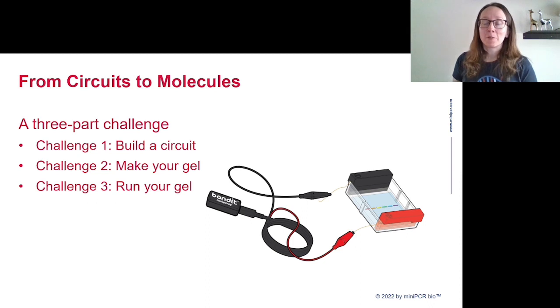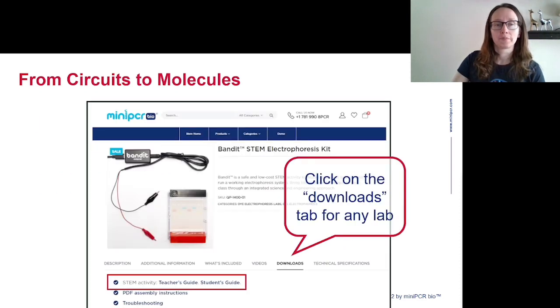That wraps up our From Circuits to Molecules Bandit Assembly Activity. It is a way to walk your students through the process of assembling and running Bandit that's pedagogical and requires them to think critically and actively about the science underlying this technique. You can download this activity for free if you go to the Bandit page in the MiniPCR store. If you go to the Downloads tab, you'll find the Teacher's Guide and Student's Guides for this activity. This is an activity that you can add on any time you use the Bandit system. You can also not use it at all. We have very straightforward building instructions separately from this activity.